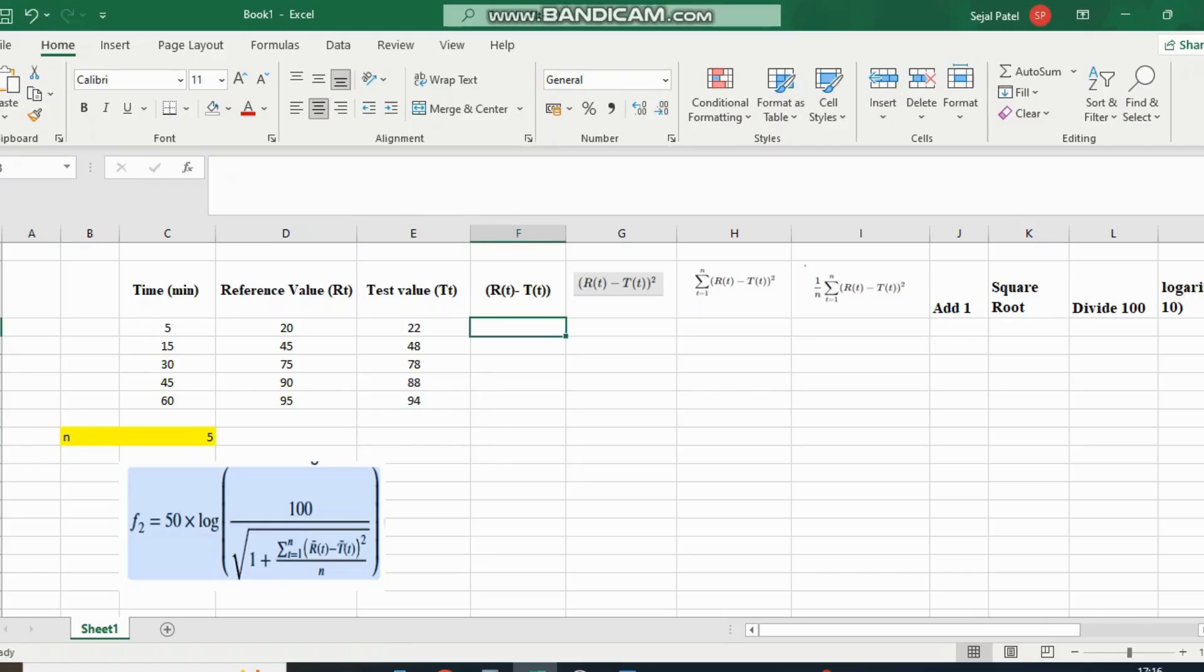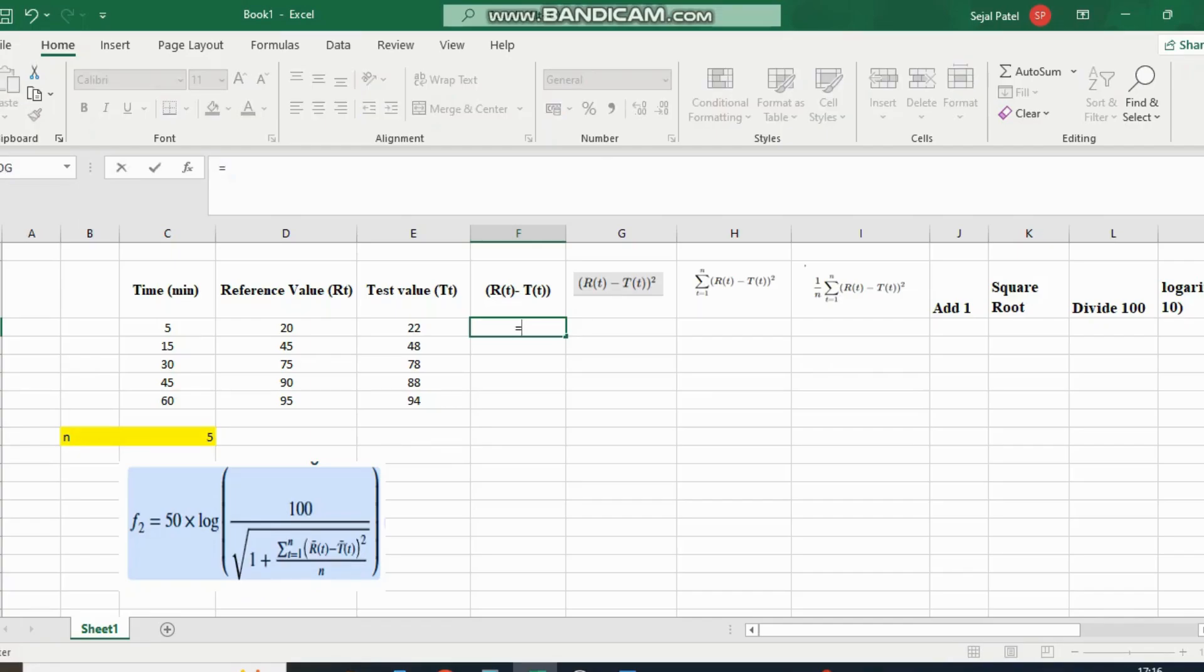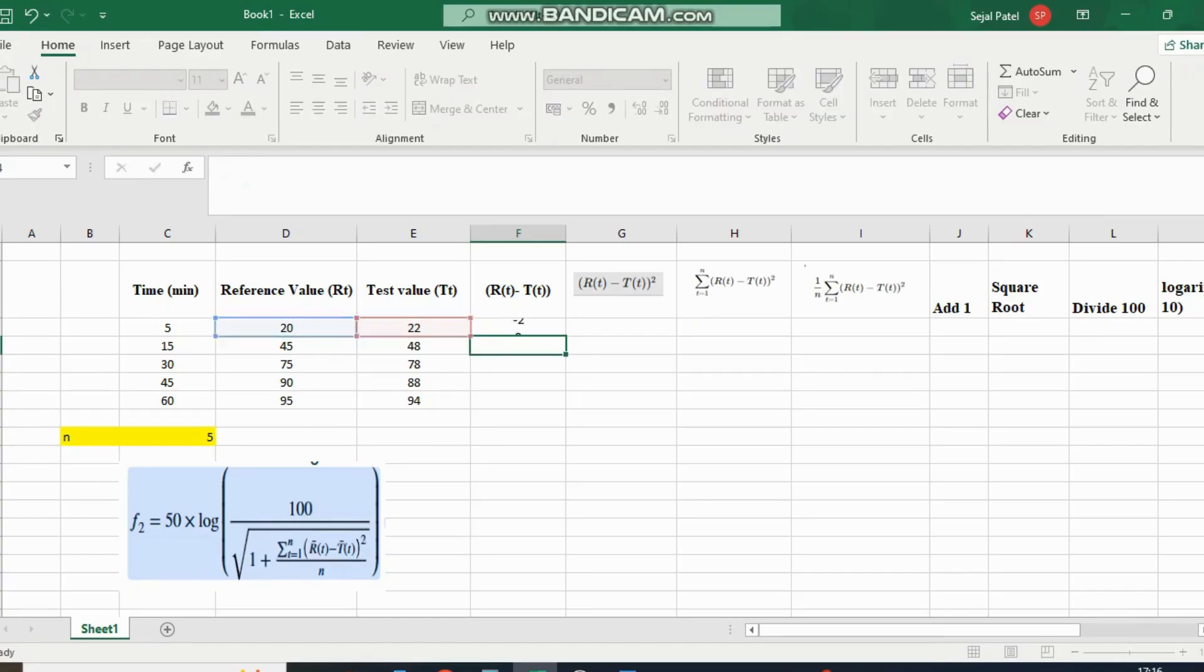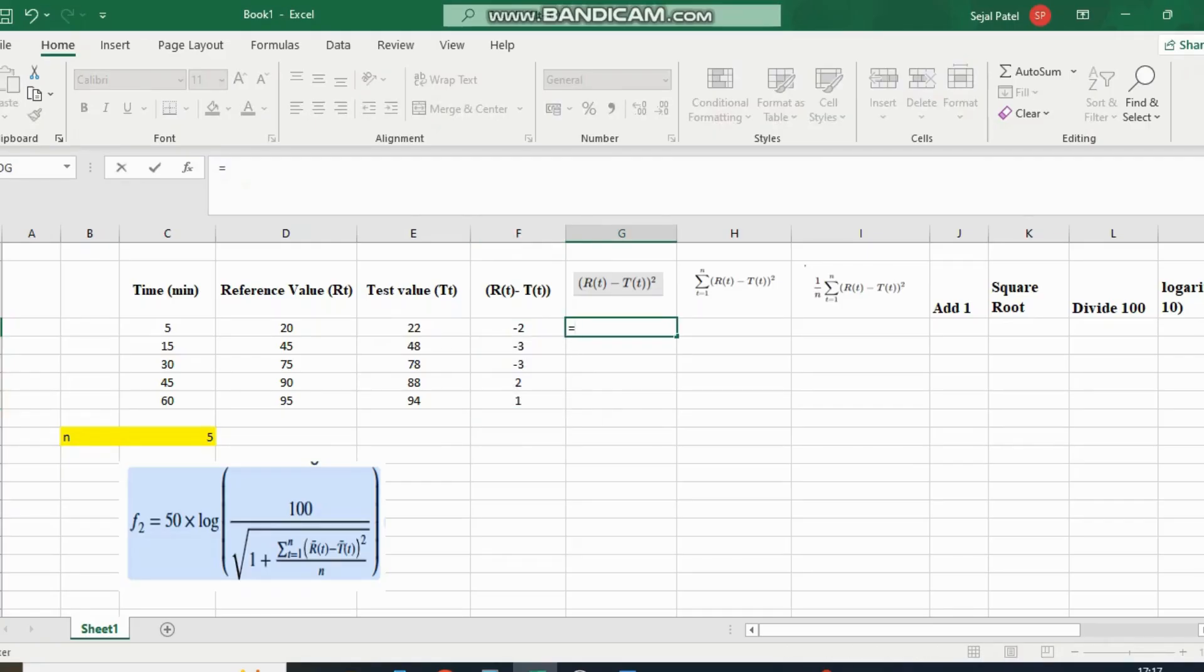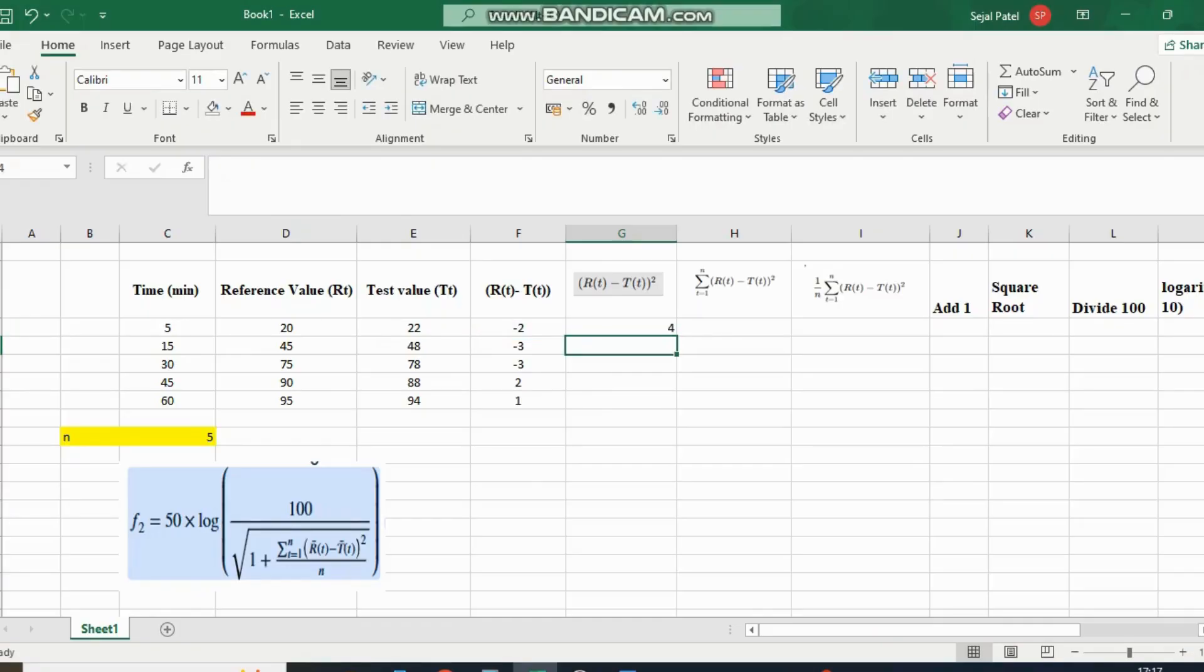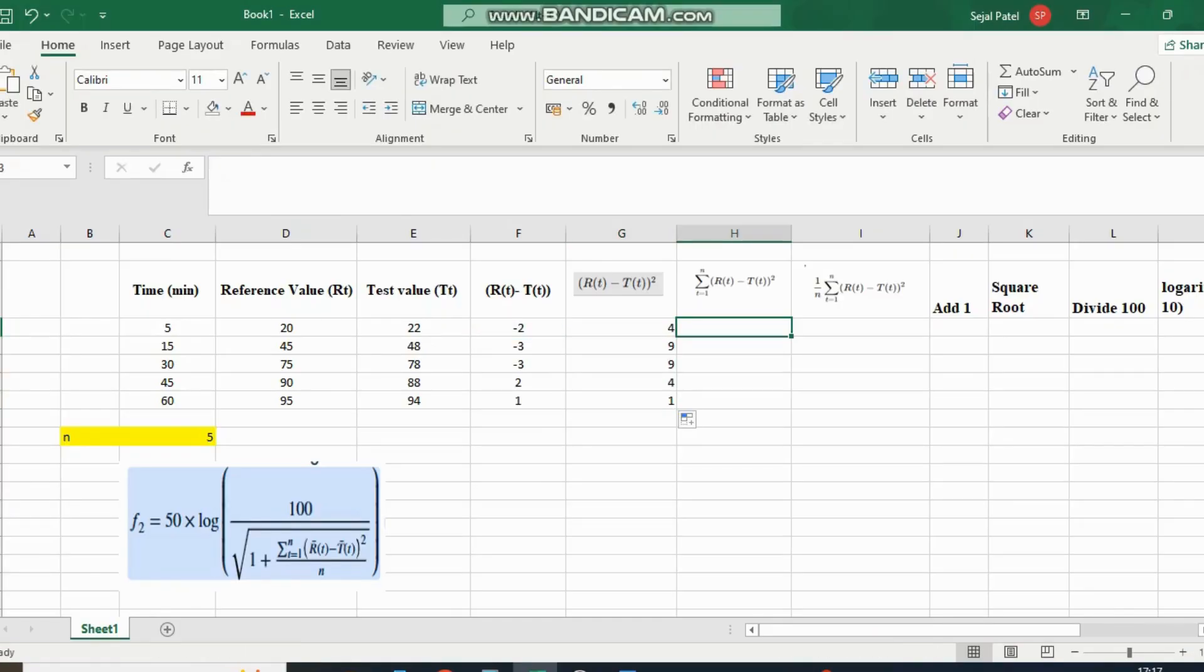Now we calculate the difference between reference value and test value. Apply the formula. Now we square this value and apply this formula to all cells.